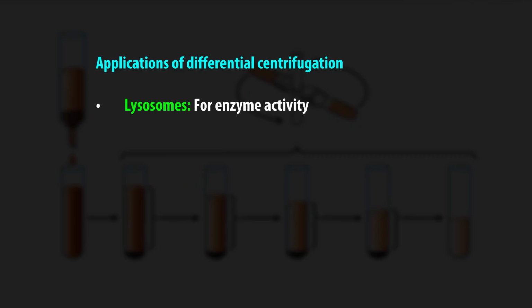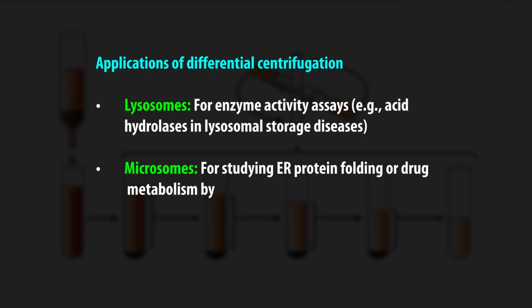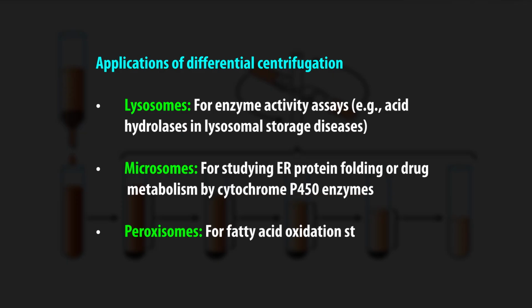Lysosomes for enzyme activity assay. For example, acid hydrolases in lysosomal storage diseases. Microsomes for studying endoplasmic reticulum protein folding or drug metabolism by cytochrome P450 enzymes. Peroxisomes for fatty acid oxidation studies.